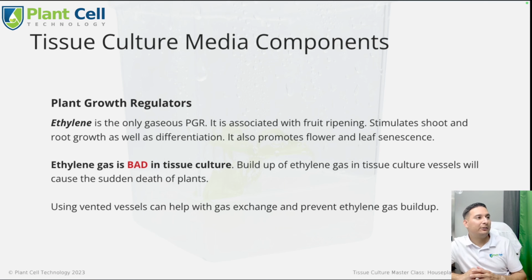For carnivorous plants, about the same, I would say. About 1 milliliter of BA or BAP, and for the NAA about the same, or well, BA or NAA. For carnivorous plants, I have found that it really doesn't matter which one you use. You still get a ton of good growth. But like I said, I still need to do the experiments to see which one is more effective. So stay tuned for that. And pretty much that's everything.